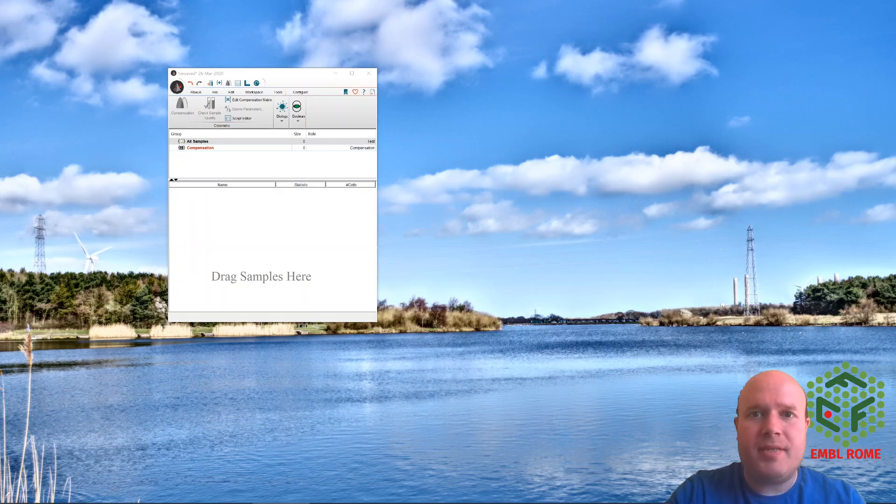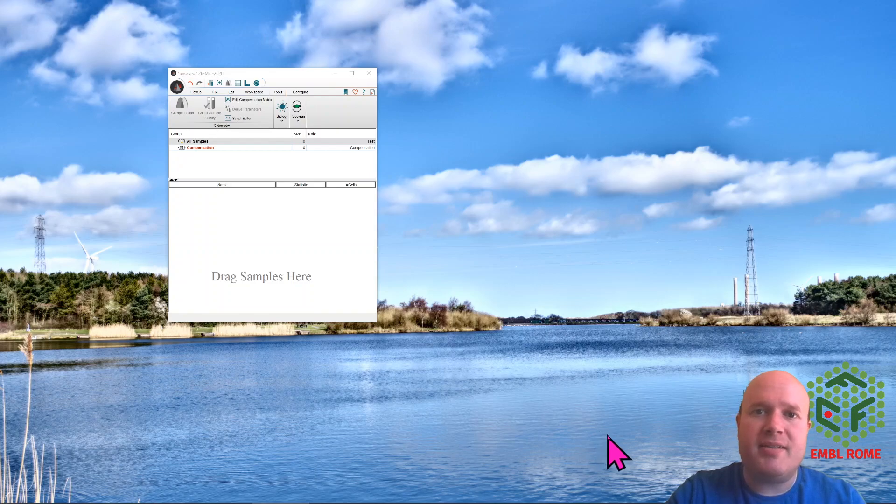Hello, today we're going to look at how to analyse proliferation data in FlowJo. This is a very easy task.